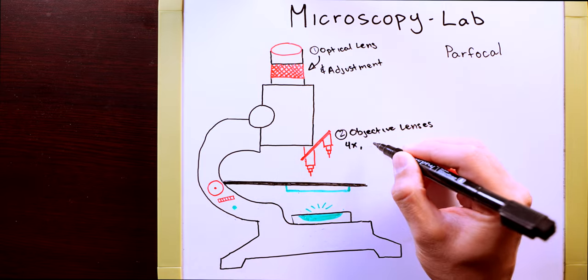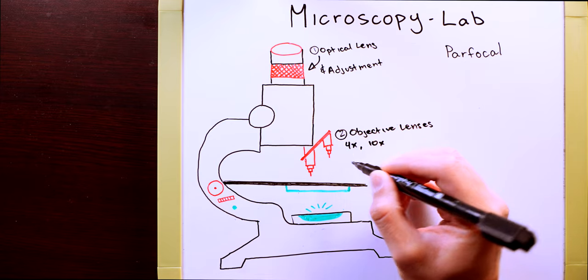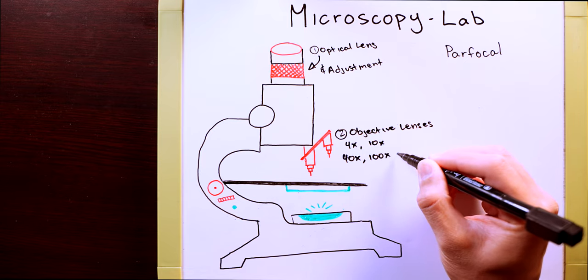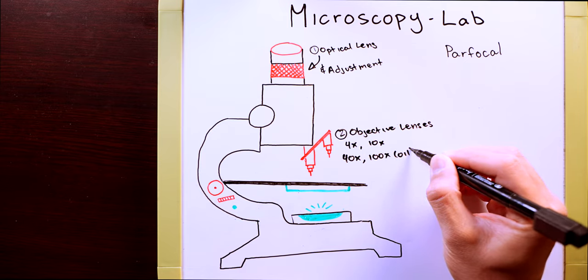And moving down from your optical lens, you're going to have your four objective lenses: a 4x, a 10x, a 40x, as well as a 100x oil immersion.